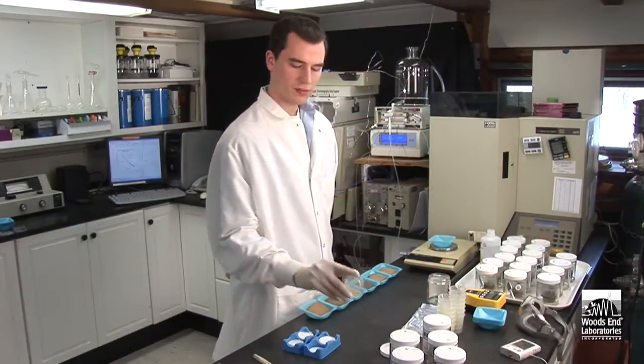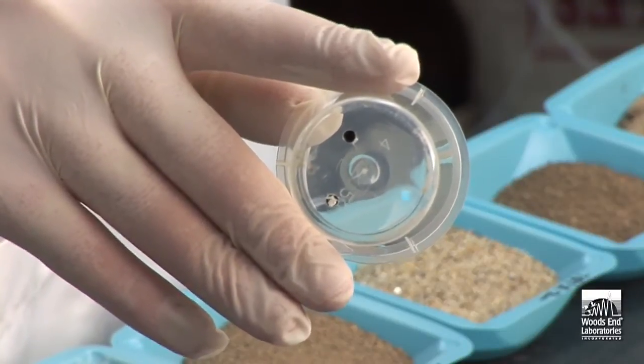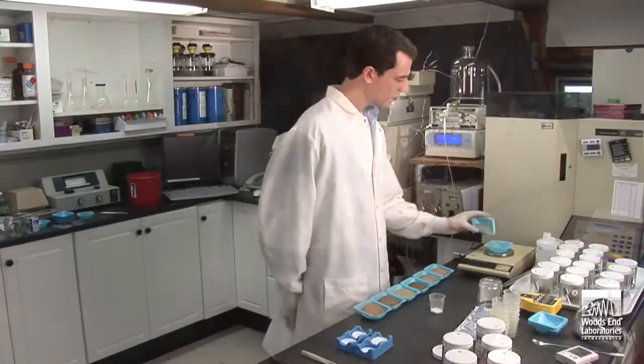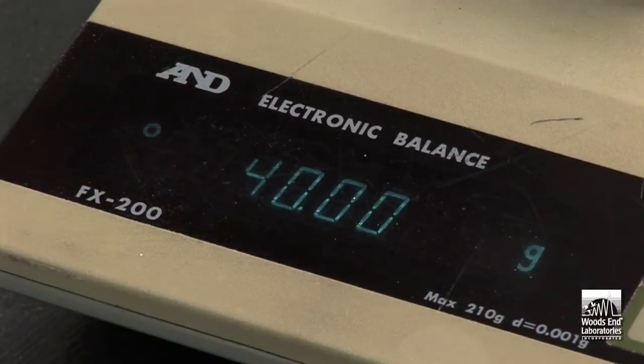Take the beakers provided in the kit. Notice that they have holes in the bottom to allow water permeation. Insert a glass fiber filter into the beaker. Next, place 40 grams of dried weighed soil into the beakers.